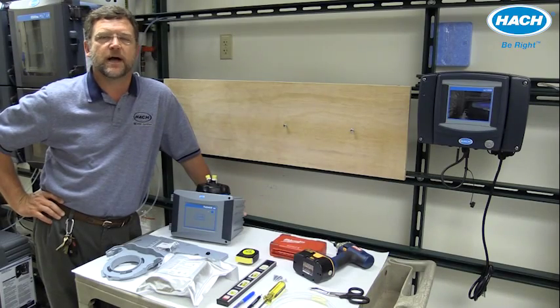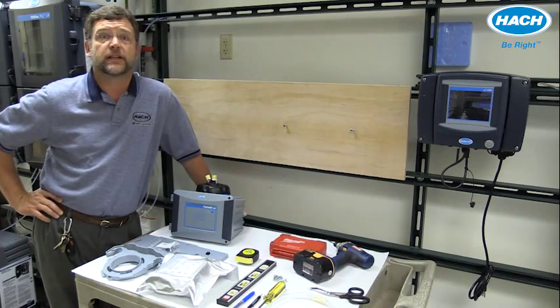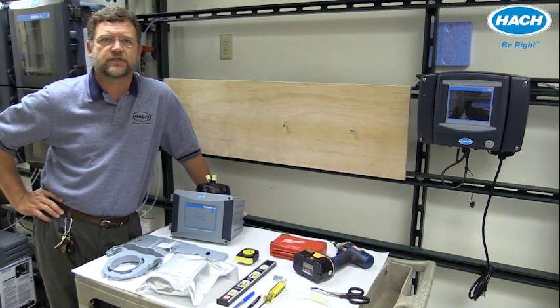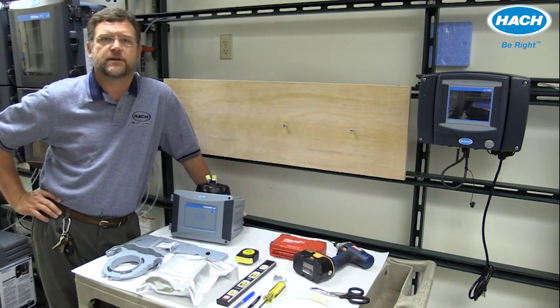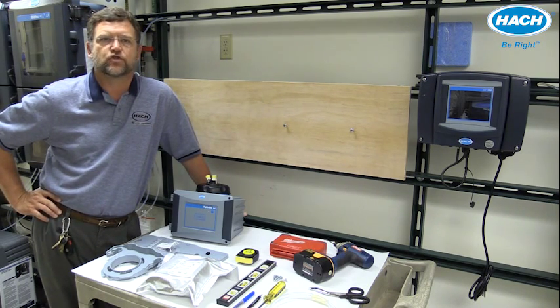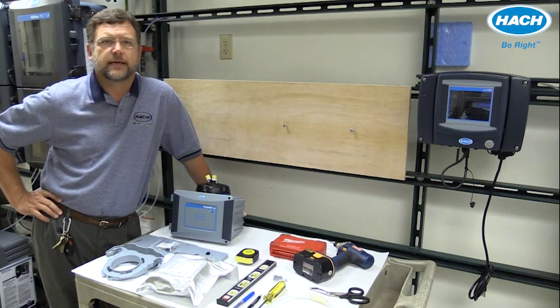The installation process for the TU5300 and TU5400 SC process turbine meters is essentially identical. The process includes seven basic steps: gathering the necessary parts and tools, choosing the best location, mounting of the sensor and maintenance rack, installation of the desiccant cartridge, connection to the SC controller of choice, plumbing of the actual sample, and setup of the analog or digital communication outputs.